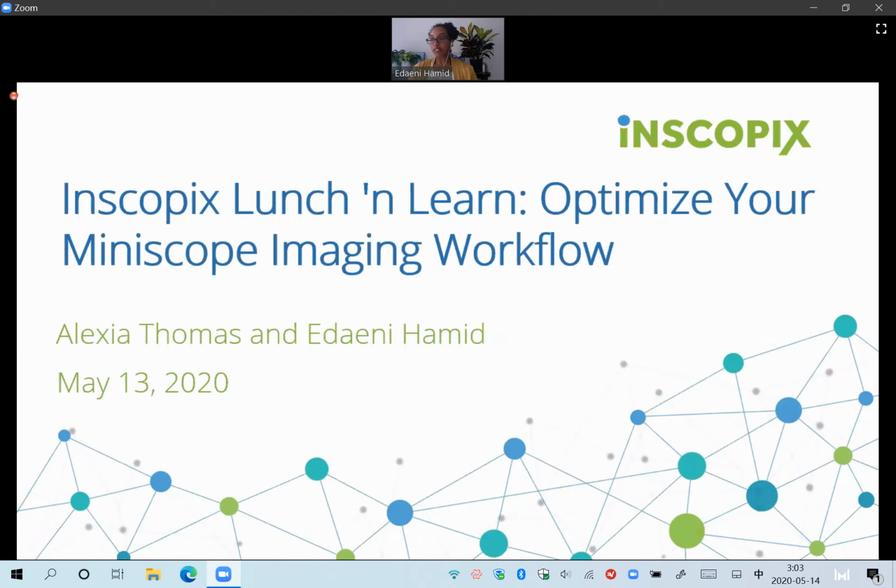Today's webinar is entitled Optimize Your Miniscope Imaging Workflow. Alexia will give you the details of the surgical workflow on how to optimize your miniature microscope imaging. And we will end it with a discussion of new products and upcoming products that we're working on to further optimize the miniscope imaging workflow.